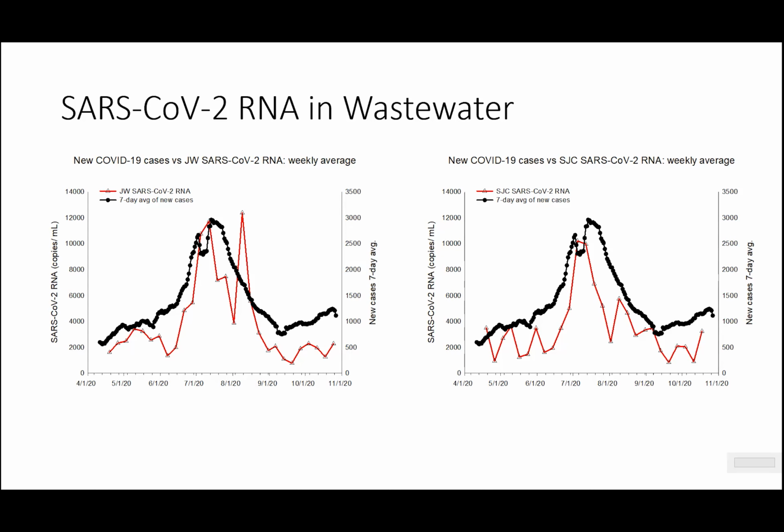Note that on occasion we do see outliers. This is exemplified by the point on the plot to the left. We actually think that this has more to do with the sample collection than the analytical process. This particular data point was analyzed on multiple occasions, with each of the data points showing the elevated concentration. Additionally, there are some other wastewater parameters that we look at on these samples that were also out of the norm for this particular sample.